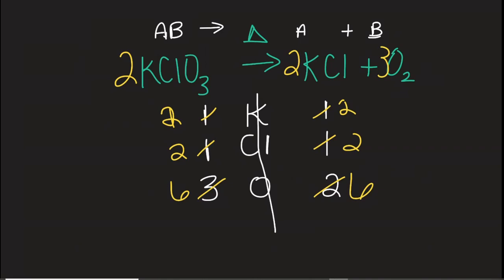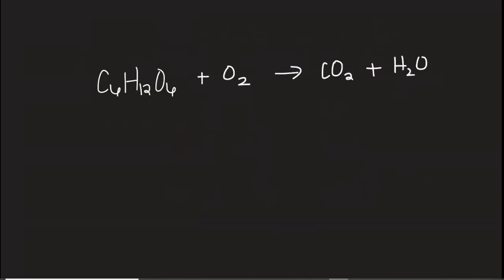The other one that we're going to be looking at, this is the second part of it, right? So after we've melted that and we have a tube full of oxygen, we're going to be dropping our gummy bear, as indicated by our glucose right here, into this tube full of oxygen. And with that heat, it's going to combust, right? And we're going to get our little fire over here, okay?